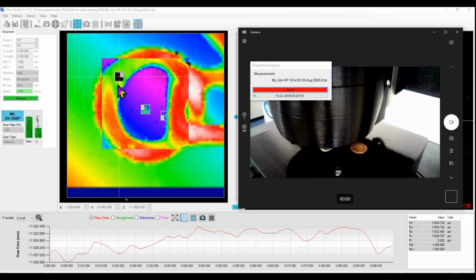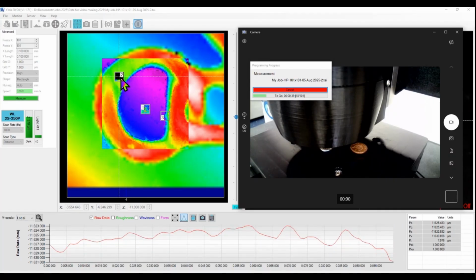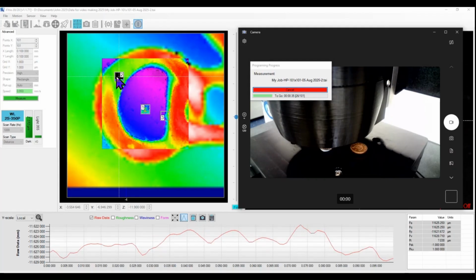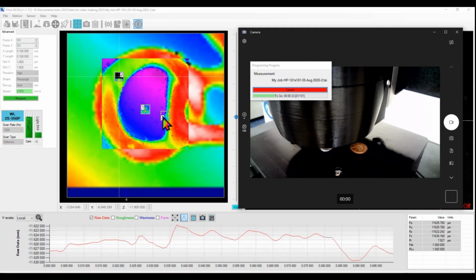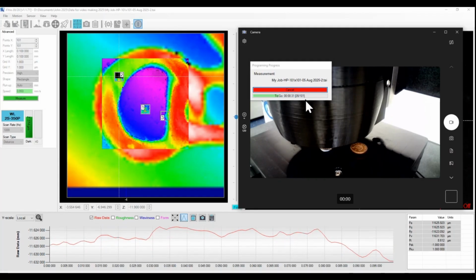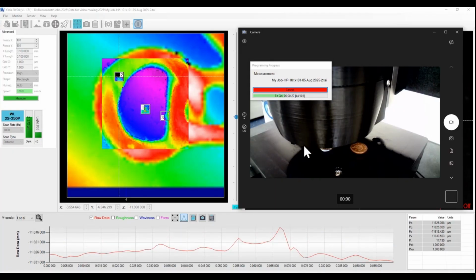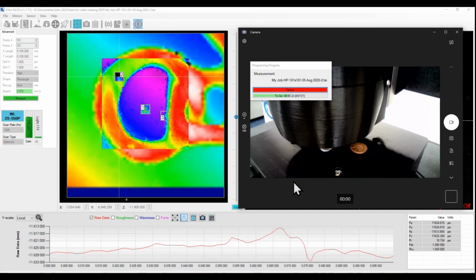It's now gone to the second measurement, so it's actually measuring here. So this moved from the measurement area here to this measurement area. And we'll see the same again. If you keep an eye on this, you'll see this move to 3 in 30 seconds. And currently this file is called file number 2. It's gradually filling the box.